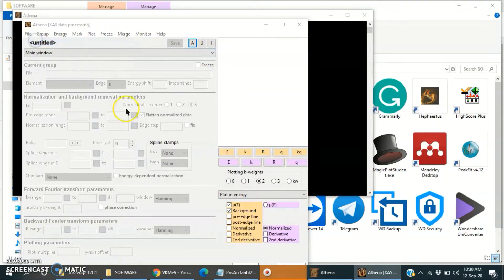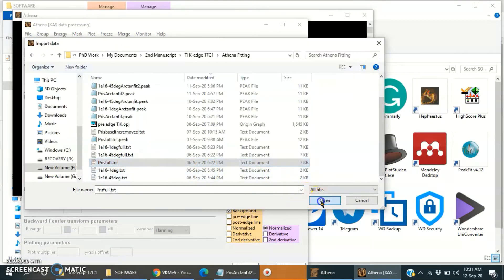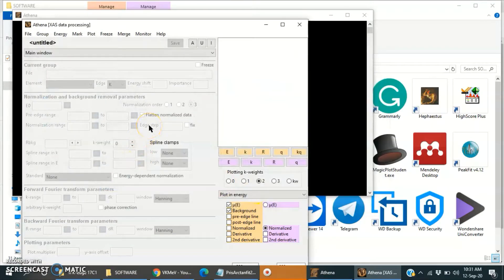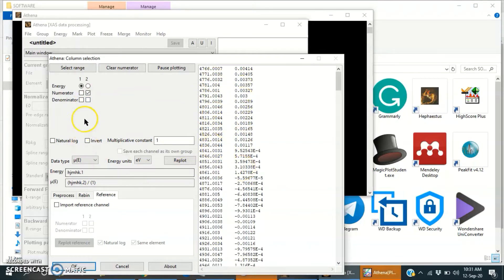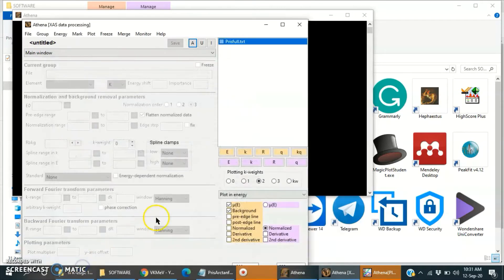First of all we will import the data. This data is already normalized, that's why there are two columns — one is energy and one is intensity. Otherwise there will be more than two columns. So if there are two columns then tick-mark this box and click OK.